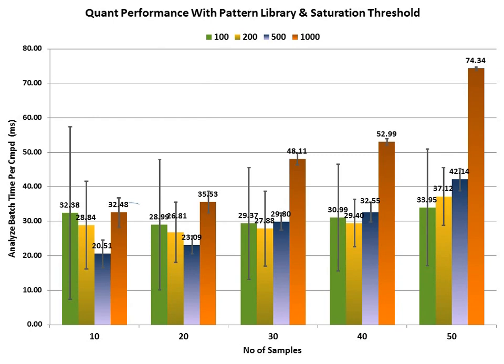An interesting phenomenon is the variation in analyze time that you see by the spread shown by the error bars. So if we look at these lower samples, you can see that the time taken for the second and third time that it's done, there's 3 points for each configuration, is significantly faster than the first time. And the reason for that is there's a caching effect. And that's because the data is held in memory, and the second and third time that you go after it, it's faster to get a hold of it.